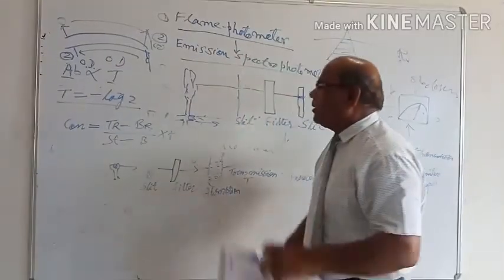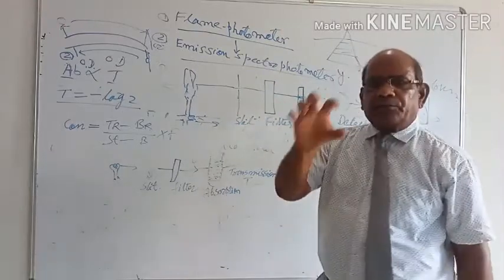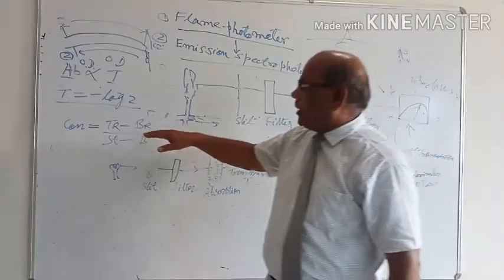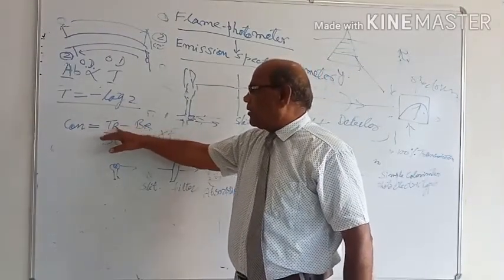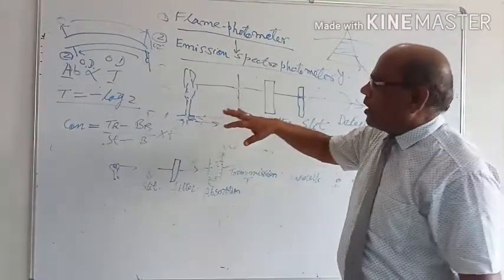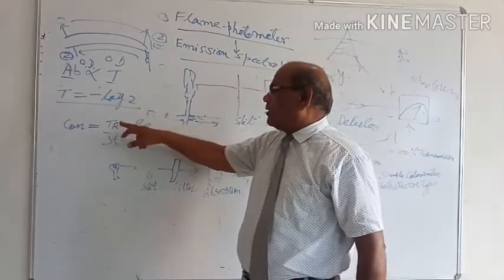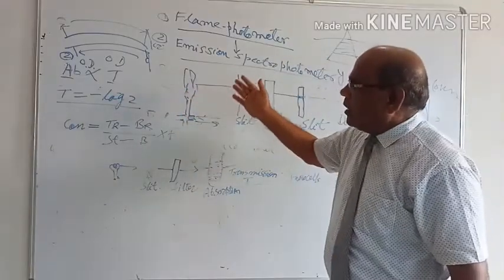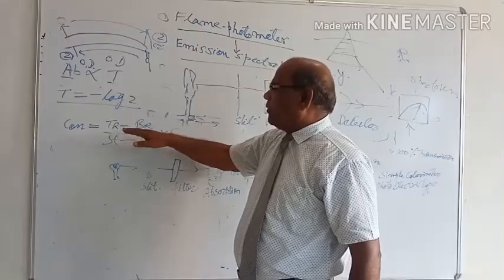Means for accurate estimation we must have some standard in our estimation, and we have a test solution in which we have to estimate either sodium or potassium, and we process the standard and test under the same experimental conditions and put the readings in the formula.